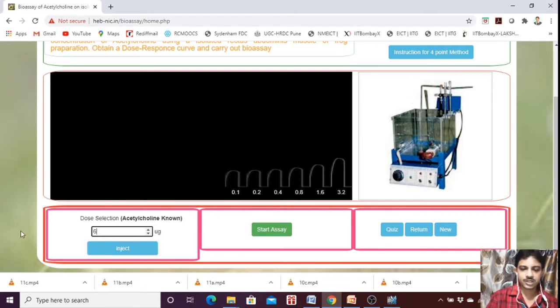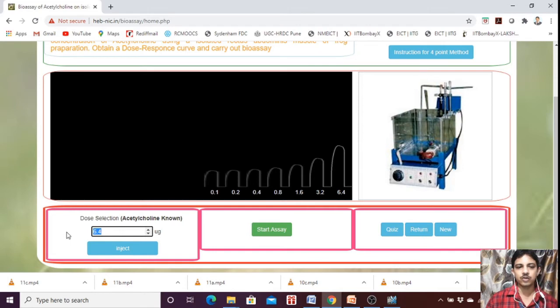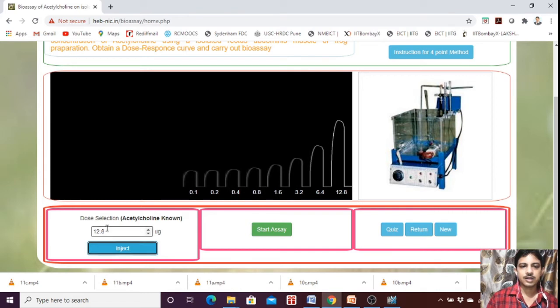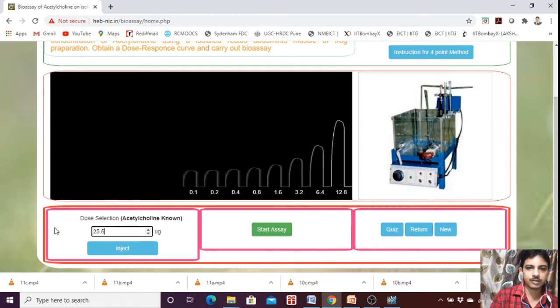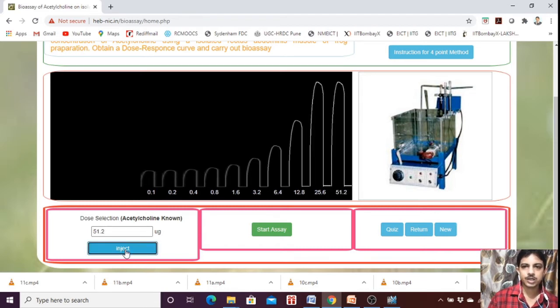Now 3.2 — inject. Now you see 6.4 — again double. You should always give the double dose, not 1, 2, 3, 4, 5, 6 like that — always give the double dose. Next is 12.8, then 25.6, then 51.2 — inject. Next 102.4 — inject.